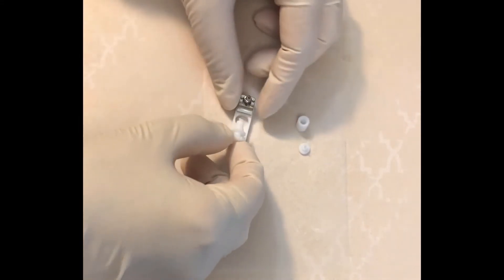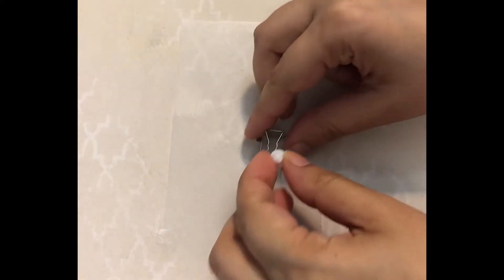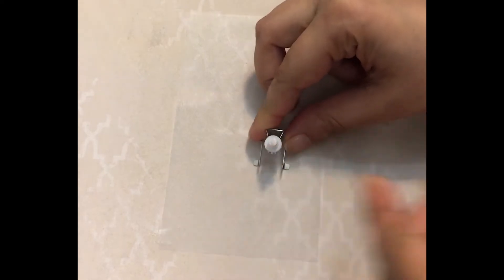Make the tubes ahead of time, then store them in a petri dish with some PBS or imaging solution to keep them from drying out. To make a tube, press the tube holder into the steel support.